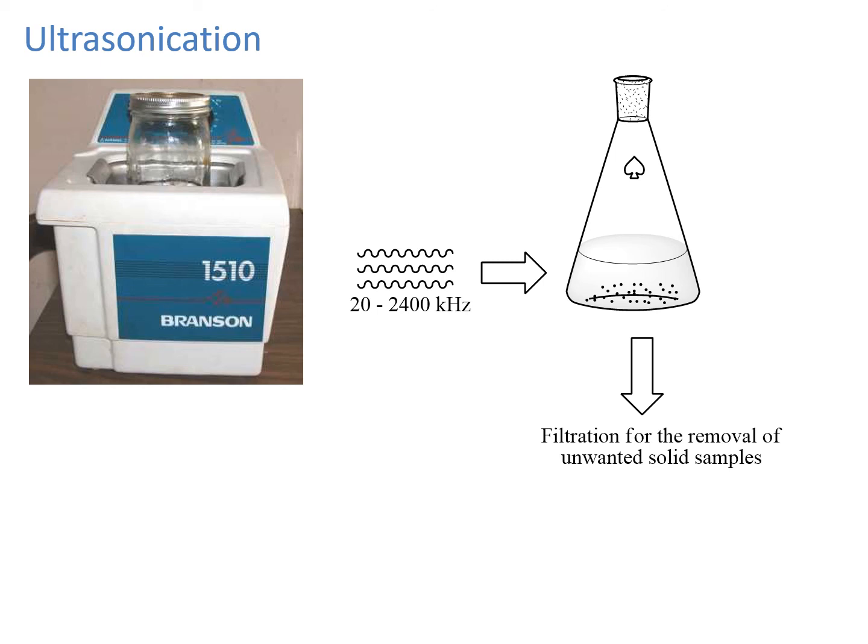Okay class, let's move on to the ultrasonication method. In this method, basically sonication will be used in order to extract the solid samples, and the samples will undergo a filtration process for the removal of unwanted solids. This procedure is quite simple, and it's available in our lab.